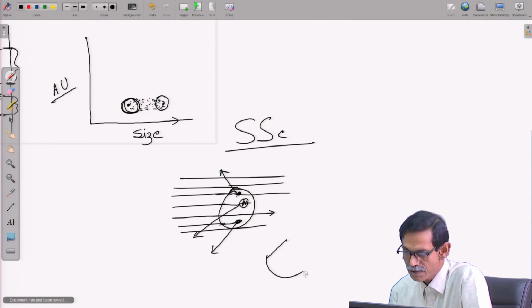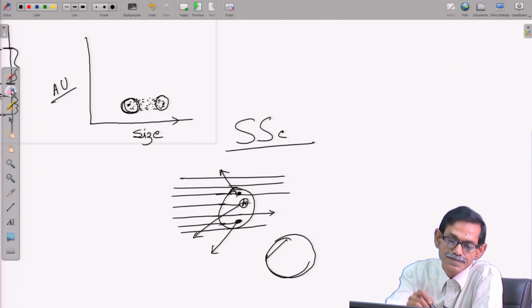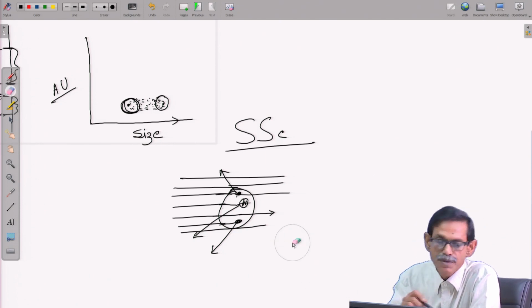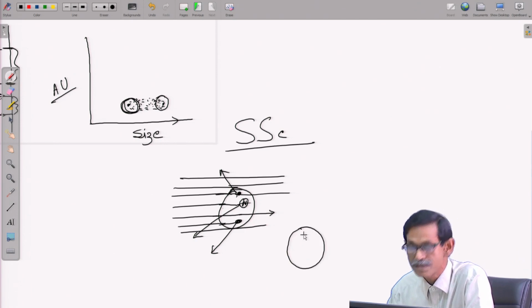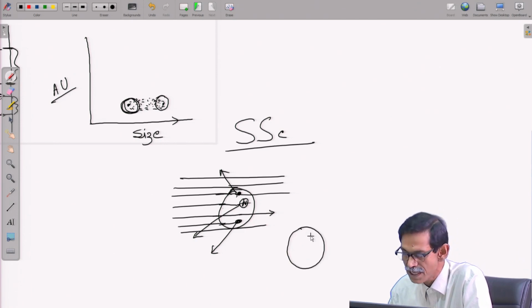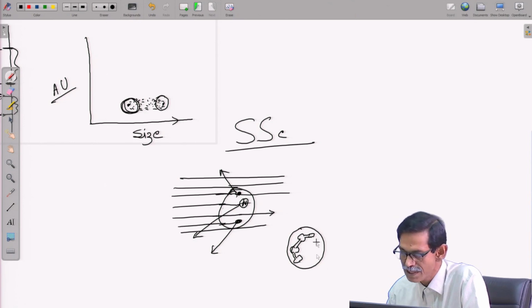If you remember, the neutrophil has a complicated nucleus. It has a lobe-like structure, right. You will see a much better picture in the book, and there are a lot of particles inside.